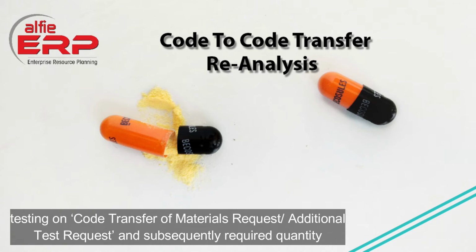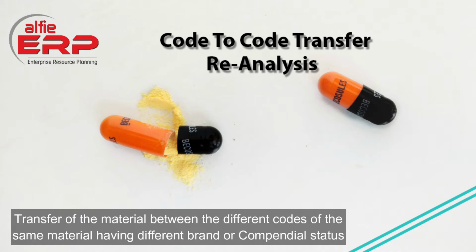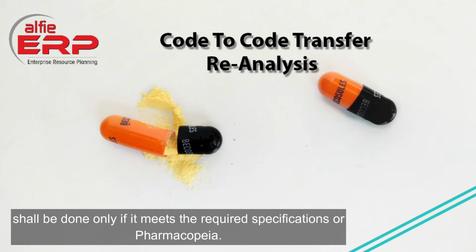Additional test request and subsequently required quantity for sample shall be updated in the Alpha to generate the AR number, and updating of this quantity. In stock ledger 2, transfer of the material between the different codes of the same material having different brand or compendial status shall be done only if it meets the required specifications or pharmacopoeia.